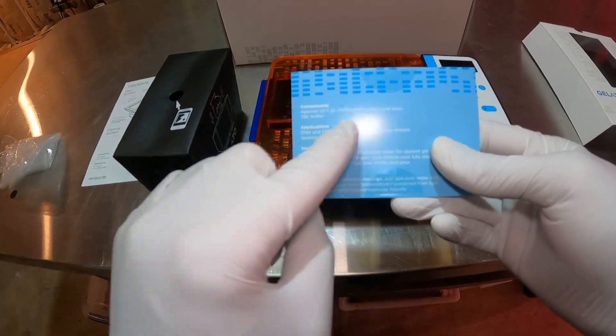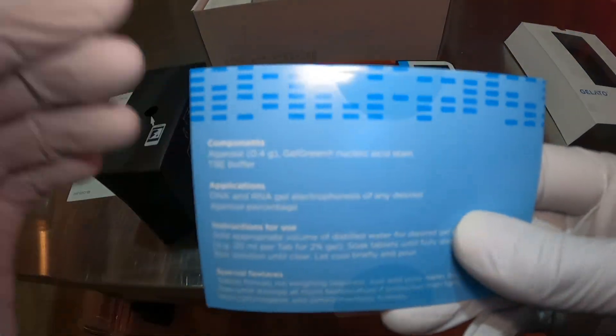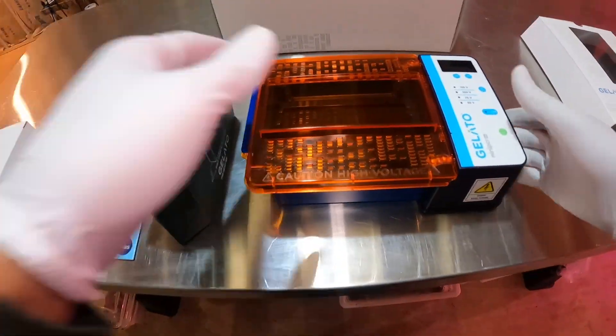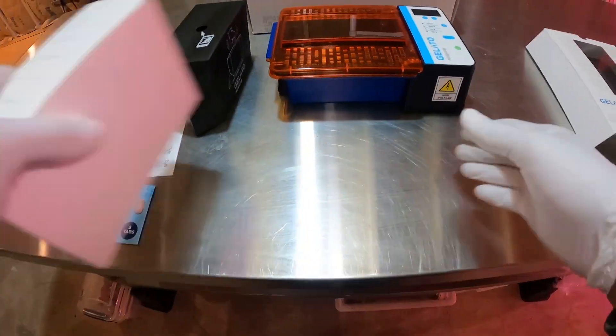I really like these gel tabs. I got to use them and we'll see at the end of the video. They have the DNA stain — they have the TBE already in it. All you have to do is mix in water, and it's so efficient.